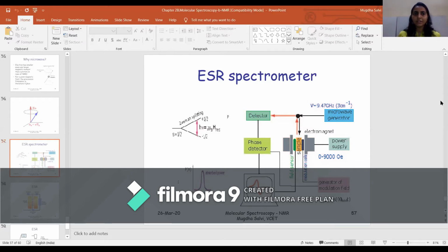Here it is written: it is the study of magnetic dipoles of electronic origin by applying usually a fixed microwave frequency to a sample placed in a varying magnetic field. It is also called electron paramagnetic resonance spectroscopy. Its areas of application are chemistry, physics, biology, and medicine. It is used to study molecular structure, reaction kinetics, molecular motion, crystal structure, electron transport, and relaxation properties of an electron.